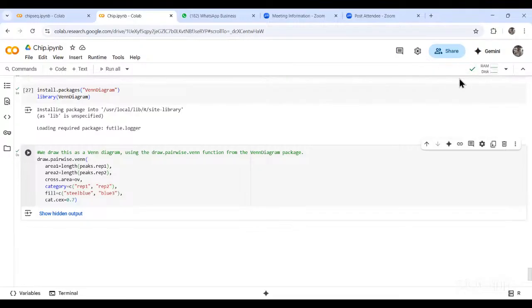Saida, is it done for you? No, sir, not yet. Pratima, Osuri? Yes, sir. Okay, great. Saida, please let me know if it is done.